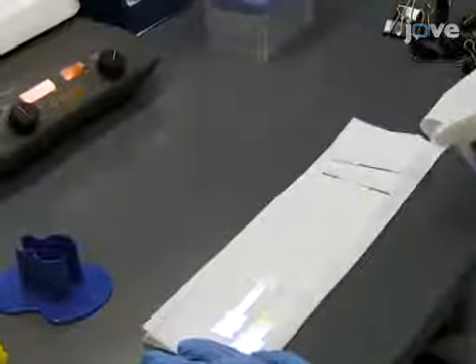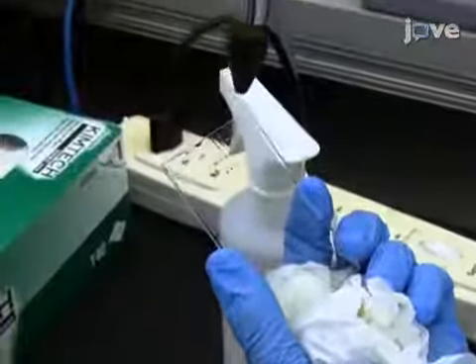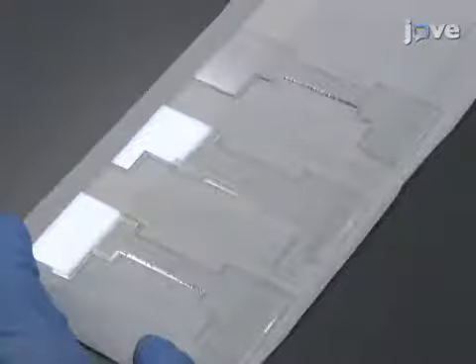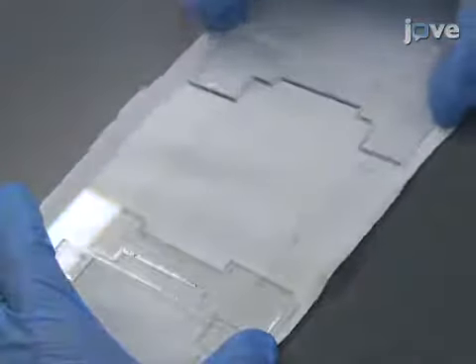Prior to assembling the agar mold, clean the acrylic molds with 70% ethanol and dry them using forced air. There are 3 bottom pieces and 2 upright pieces. To begin assembly of the agar mold, take the 3 bottom pieces and assemble them so that the 2 identical pieces sandwich the 3rd piece.